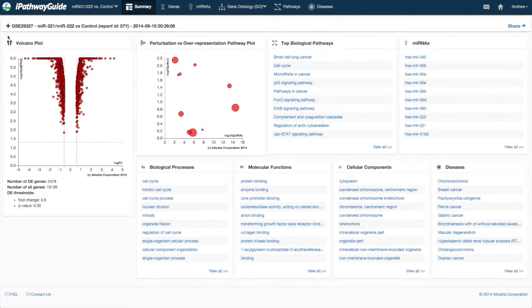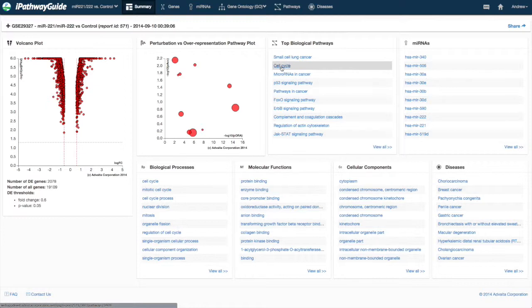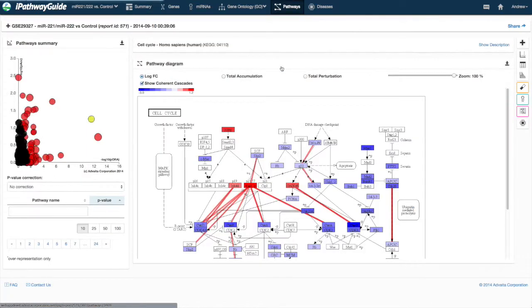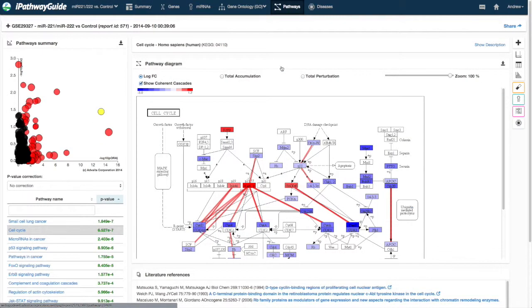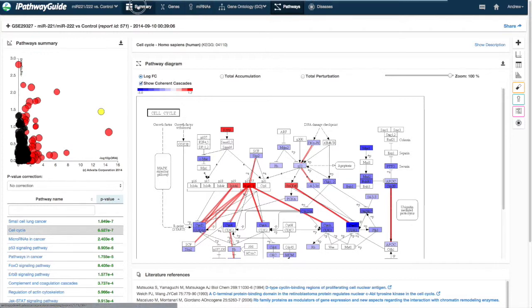Clicking on any one of the results in the summary page will take you to the corresponding result in that related tab. For example, clicking on the cell cycle pathway in the list of pathway results will take you directly to the pathways tab with that result selected.